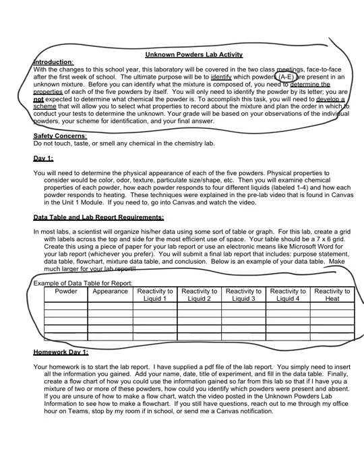Okay, once you have all that information filled out, you are then going to make a flow chart, which is going to be a tool you're going to utilize to figure out what's in the mixture when you start mixing these substances together. And I'll have a short video on that and a how-to as to how to make the flow chart.